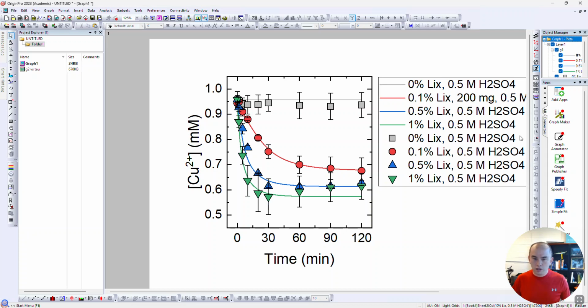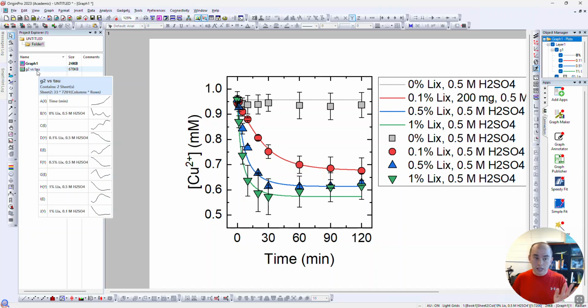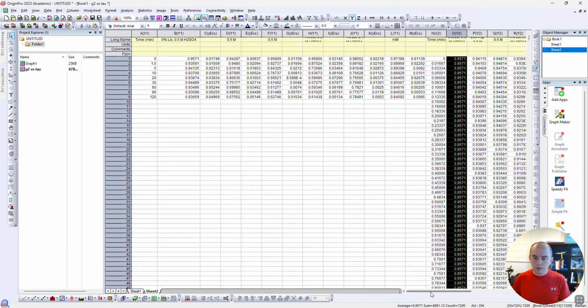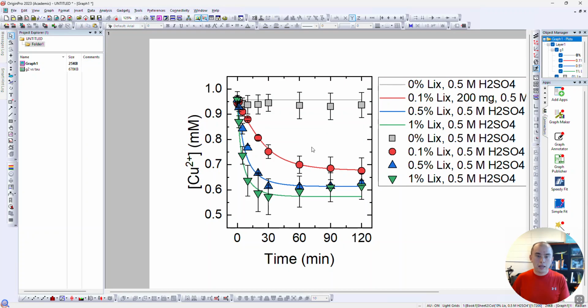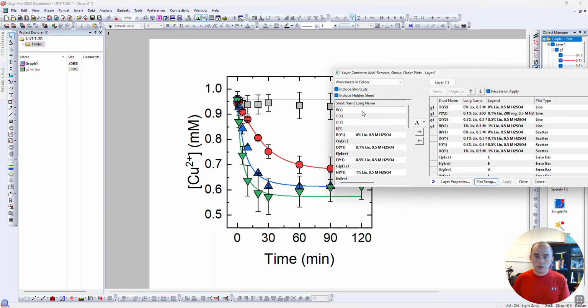We want just the symbols and a black line for the model. The issue is the black line for the model is sort of hard to do, right? So we need to actually have a dummy data series in there. So I'm going to do that by just having this be what I call dummy. I'm going to go back and add this to this guy.